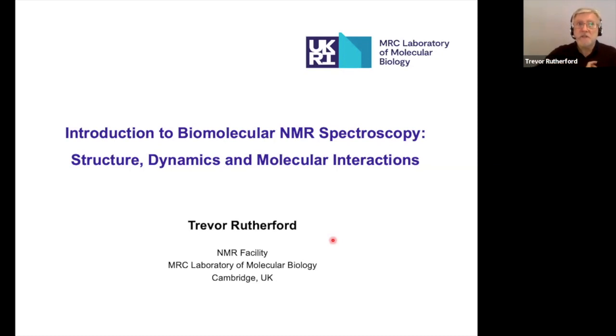NMR is a technique that uses this landscape of local internal fields within a molecule to give information about the composition, the three-dimensional shape, and the way in which that three-dimensional shape is changing in time, the dynamic properties of the molecule. Okay, so that's the basic idea of what biomolecular NMR is all about.